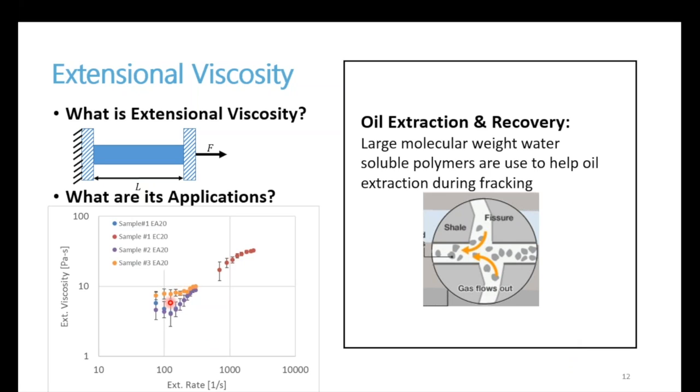And here you can see some examples of a few different HPAM formulations in water or seawater, and you can see how these fluids are characterized by strain hardening. So as you stretch them at a higher strain rate, you're going to have higher extensional viscosities.